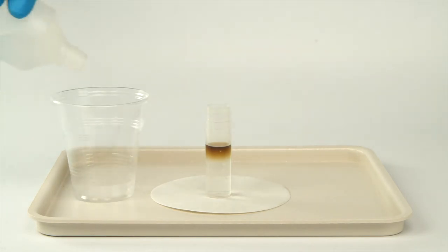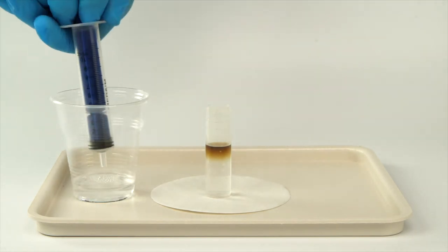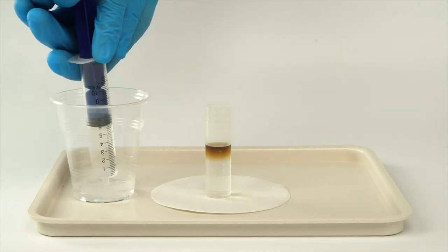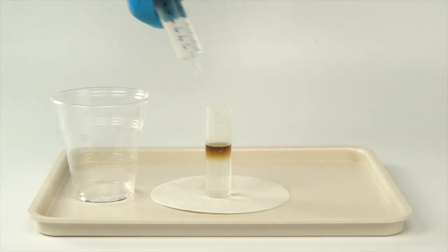Next, add an oxidizer. Pour some 3% hydrogen peroxide into your plastic cup. Using your syringe, fill the vial to the brim with hydrogen peroxide.